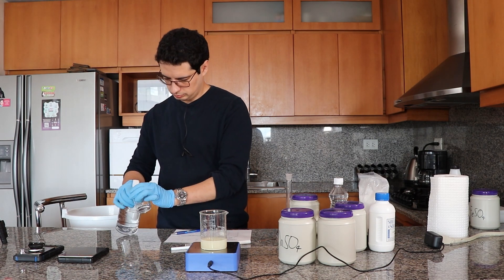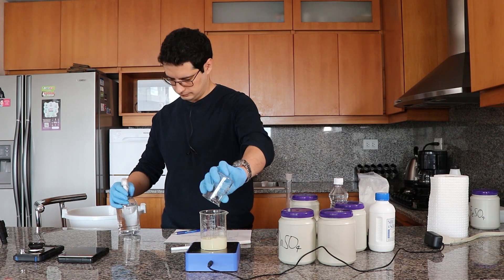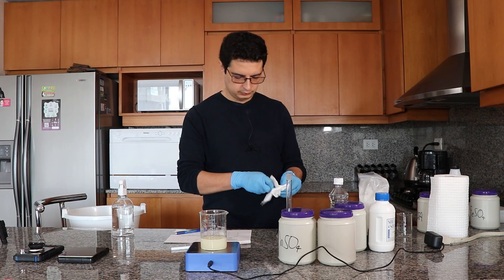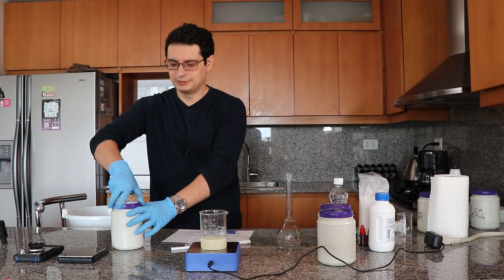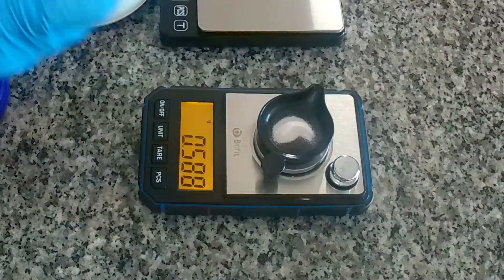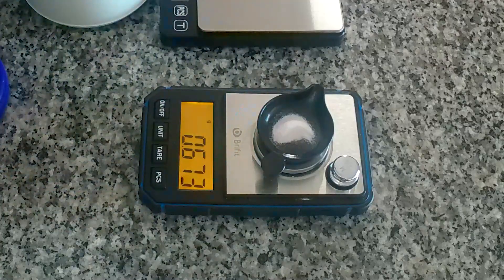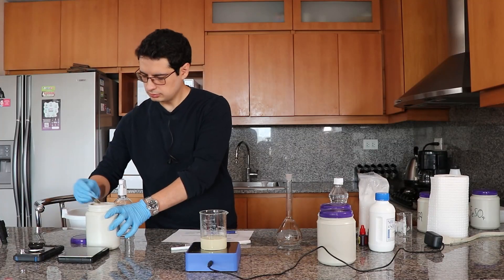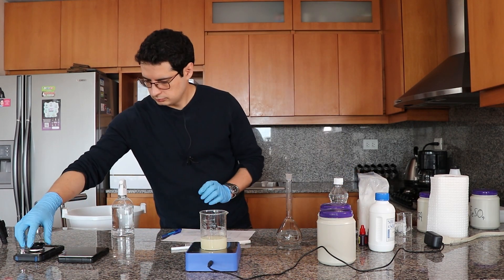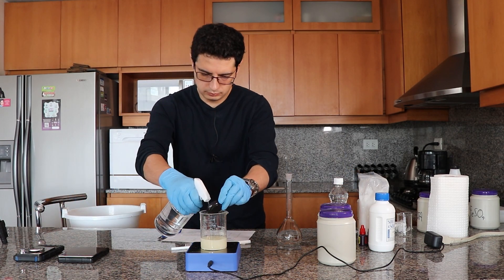I changed the flask there because that one stopped working, so I have a new flask now. Next we're going to add the manganese sulfate. This one dissolves fairly easily and is generally higher purity than ferrous sulfate, so you usually get better quality with this one.